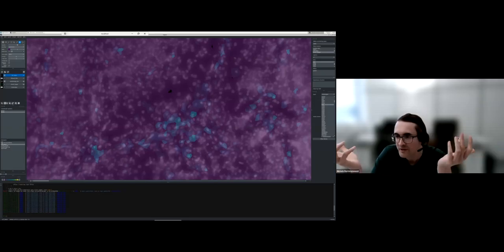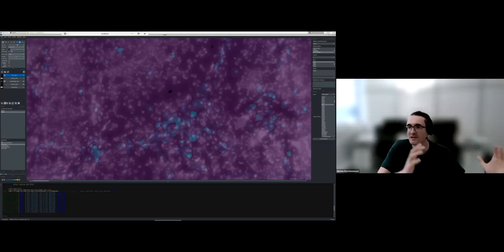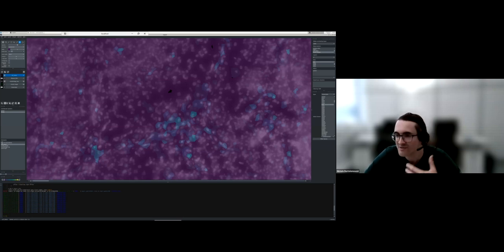And the way this all works is because of the way the spatial data object is set up: all the gene expression and all the annotation that are stored in the table are linked to the labels of our cell segmentation. So it becomes really easy to create these interactive visualizations.